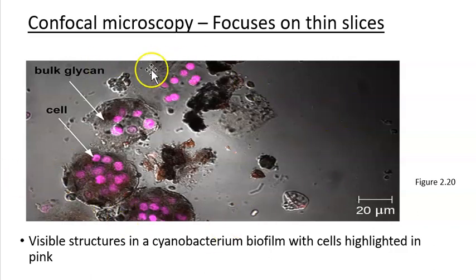And here you have a biofilm, so think of it just like a slimy thing, and inside of it they've actually been able to highlight these little bacteria cells that are highlighted with this false pink color there to allow you to actually reconstruct the three-dimensional structure there. And this is what's called the optical sectioning. You take sections through there and then stack them together, and it gives you some more idea about the surrounding area and the cells within there.